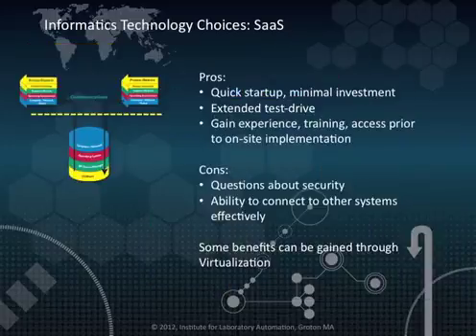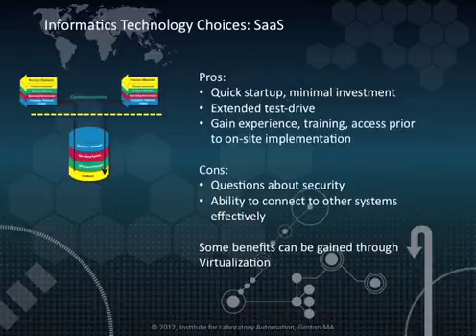As with anything else, there are trade-offs. On the plus side, the software as a service model provides a quick startup with minimal investment. It can be used as an extended test drive of the system if you're considering the product for purchase, and gives you a chance to gain some experience and provide training while an on-site implementation is going on. On the downside, as we've noted, there are questions about security and the ability to connect to other laboratory systems.